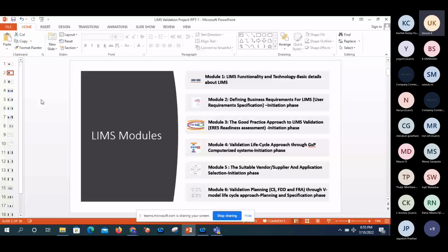You have a license for this, so to validation. To validation means you have that license. So based on that, we are going to learn. License? No, we don't have any license. License is different actually. See, the application, the vendor should not provide it to just anybody, irrespective of the industries.